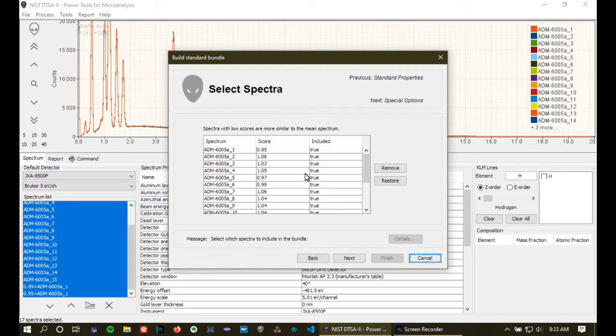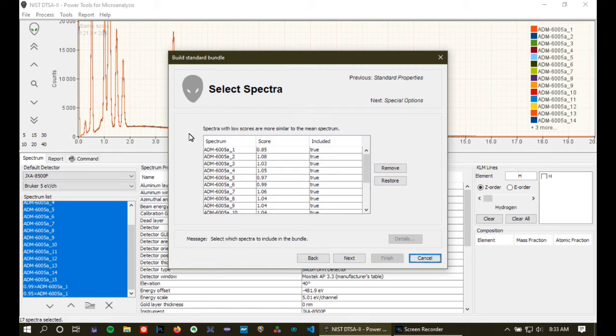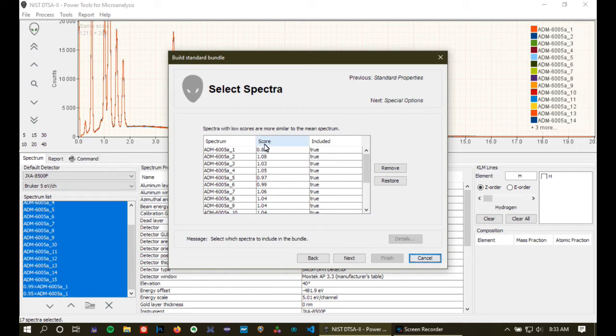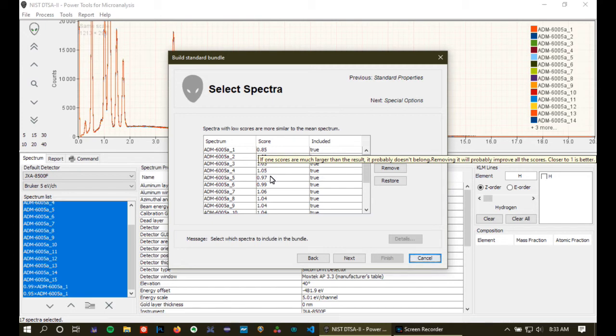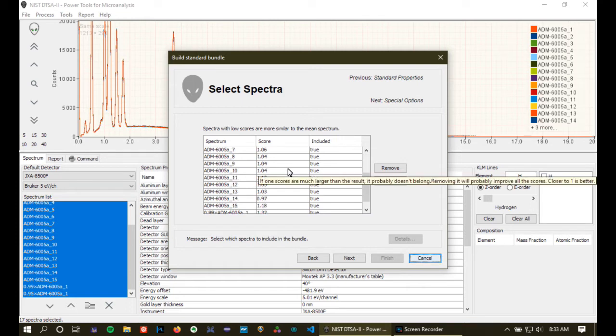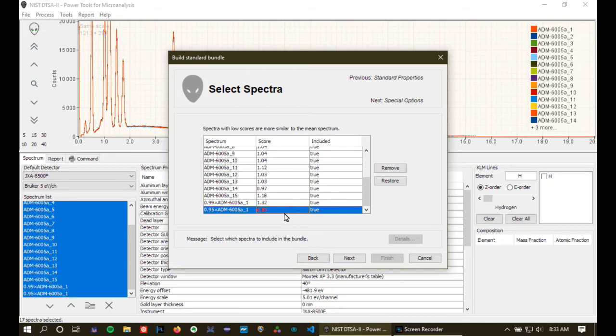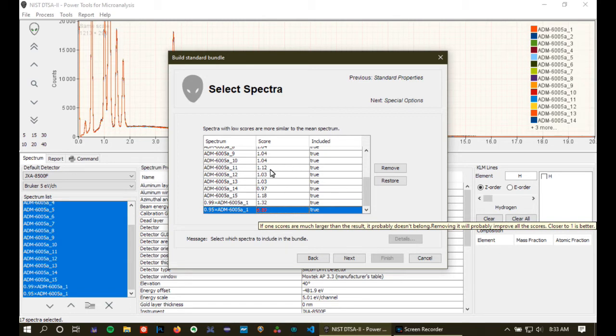Now we see the next page basically allows us to pick which of those 17 spectra we're going to use in our bundle. Well, the dialog box provides a score. This score, essentially you want it to be close to 1. Close to 1 means that the spectra are similar up to count statistics, differing only by count statistics. When you get a number above 1, like this one down at the bottom, that suggests that this spectrum is actually substantially different from the other spectra. And because this is an extremely homogeneous material, we're expecting a score somewhere around 1.